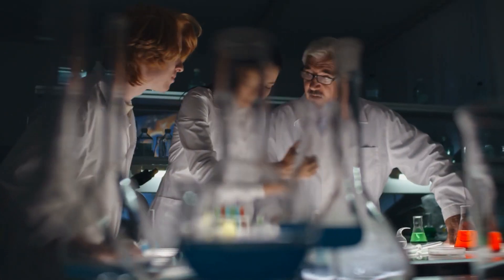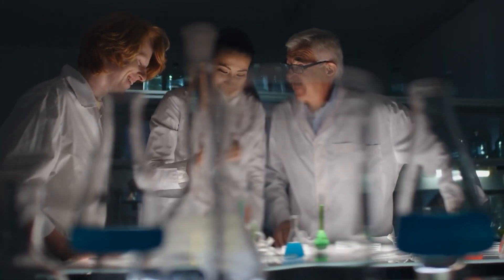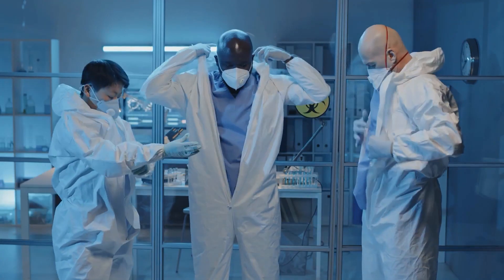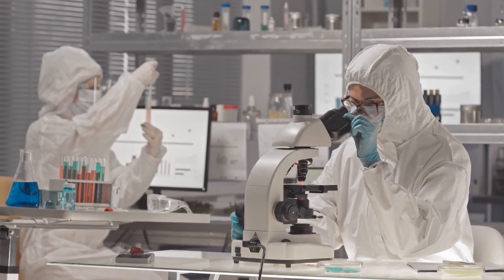For years, scientists have been committed to finding effective ways to mitigate the risks associated with laboratory work, where the potential for injuries is a constant concern. This ongoing pursuit of safety has led to the development of various protective measures and innovations designed to create a safer working environment in labs.